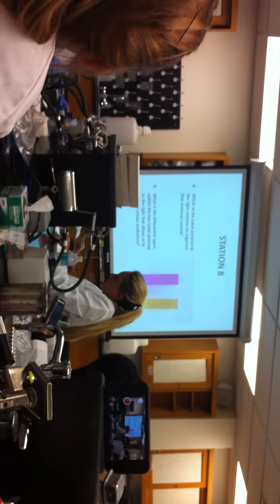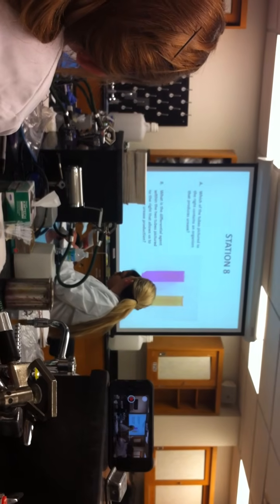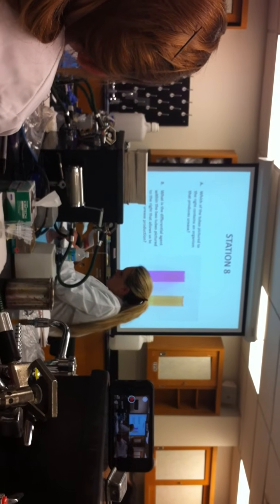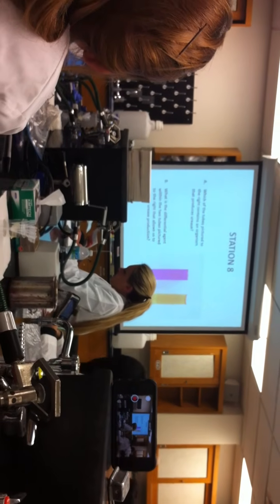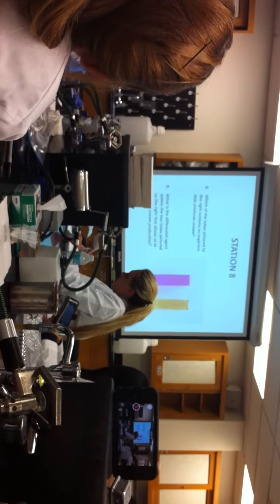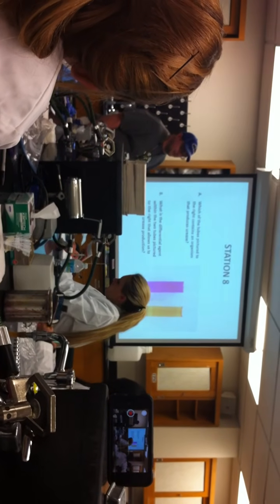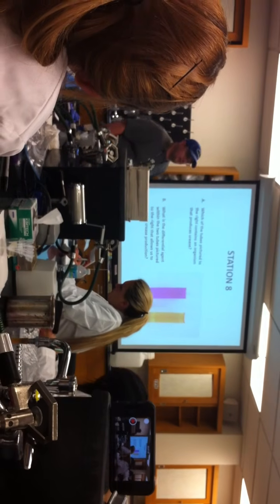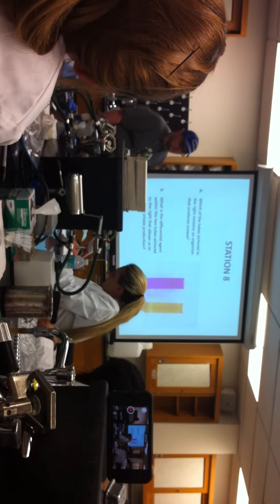Okay, y'all remember this? What organism produces urease? Hot pink. Okay, remember that is positive. Why is it positive? What is urease? Urease is an enzyme that breaks down what? Urea. So what's happening to the pH of that tube? So basic. It's getting more basic.